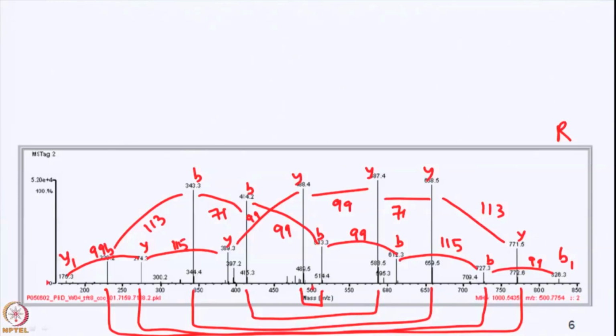Let's do one other thing. This is mass 1000, sorry. Can you read that? That's not a fake peak. We know that is reasonable because we measured the precursor mass before we did the MS/MS spectrum. The precursor mass is 1000. If it's 1000, we can go from here with 129. Precursor mass is like a Y ion. It's like the last Y ion.